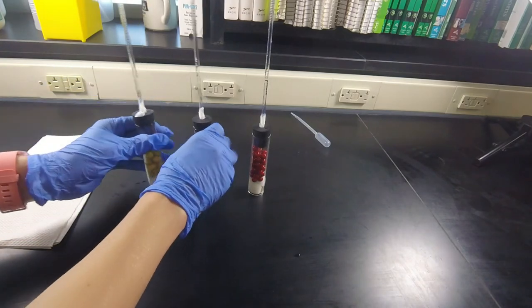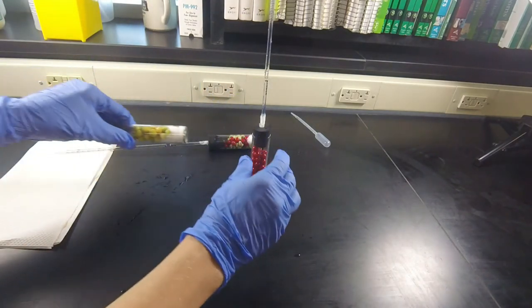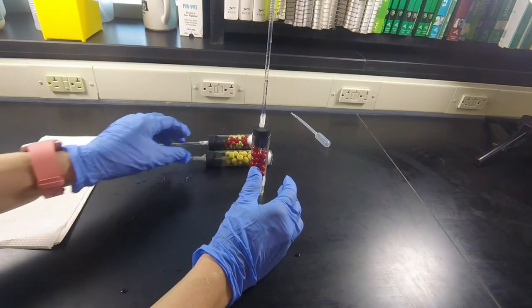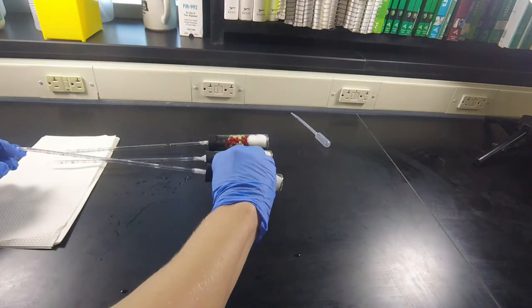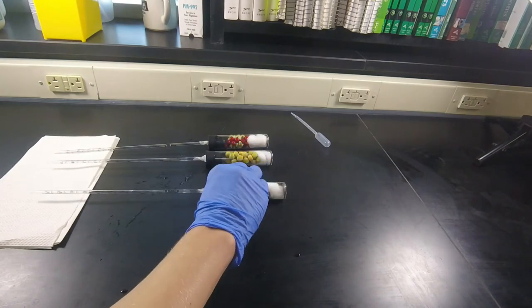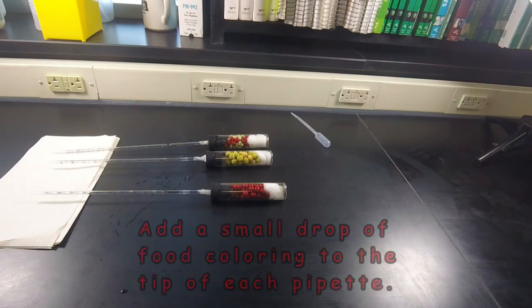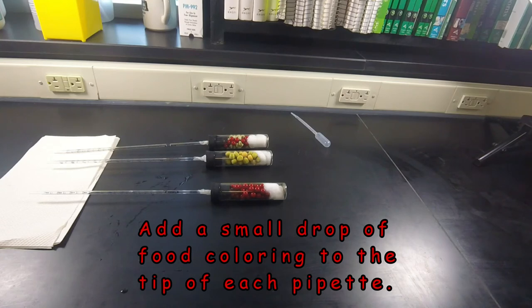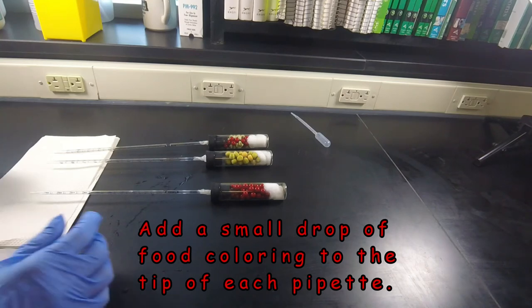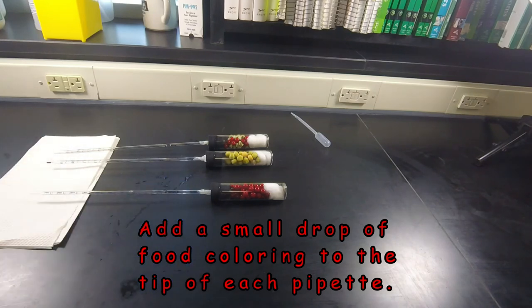Then you're going to lay each of the respirometers very gently over a paper towel. Using your food coloring, you're going to add it to the tip of the pipette by hanging a drop and allowing the drop to just barely touch the tip so that wicking action pulls the drop into the tip.